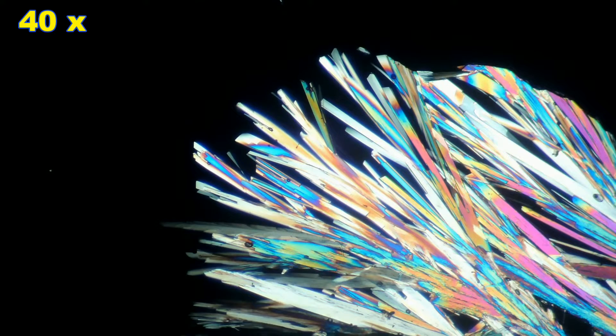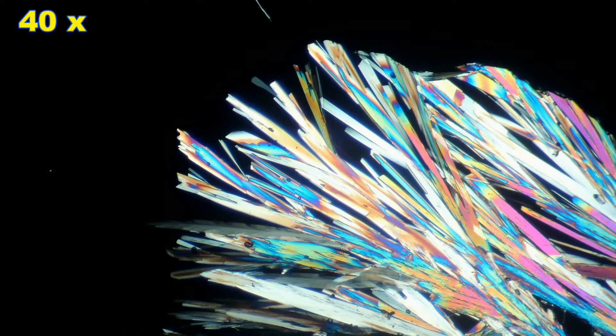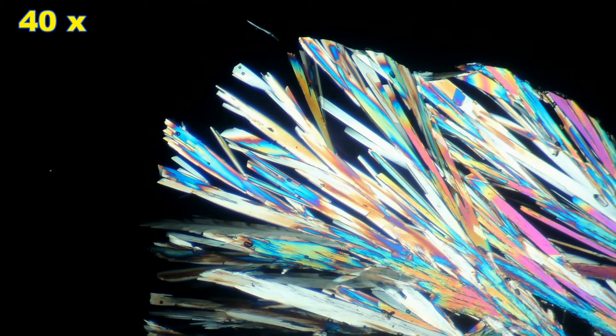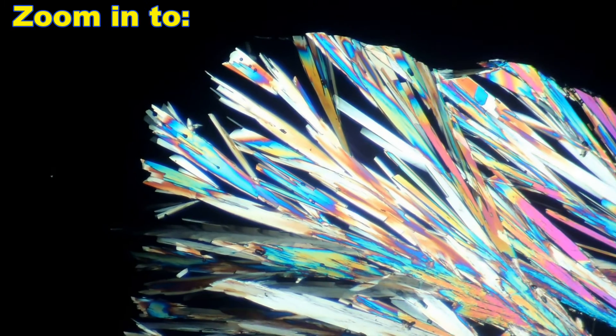What we see here is the crystallization occurring in time-lapse. It's been melted and allowed to cool and then re-crystallize. Crystallization did not start for several days.